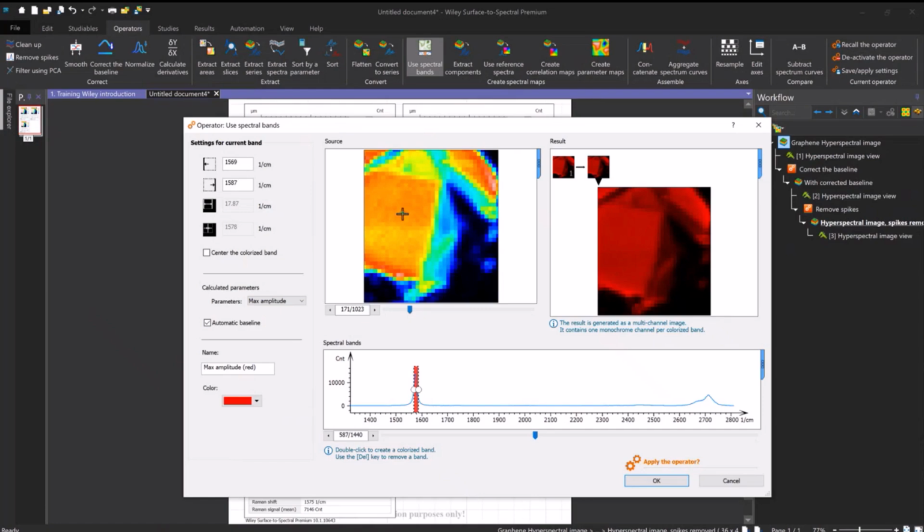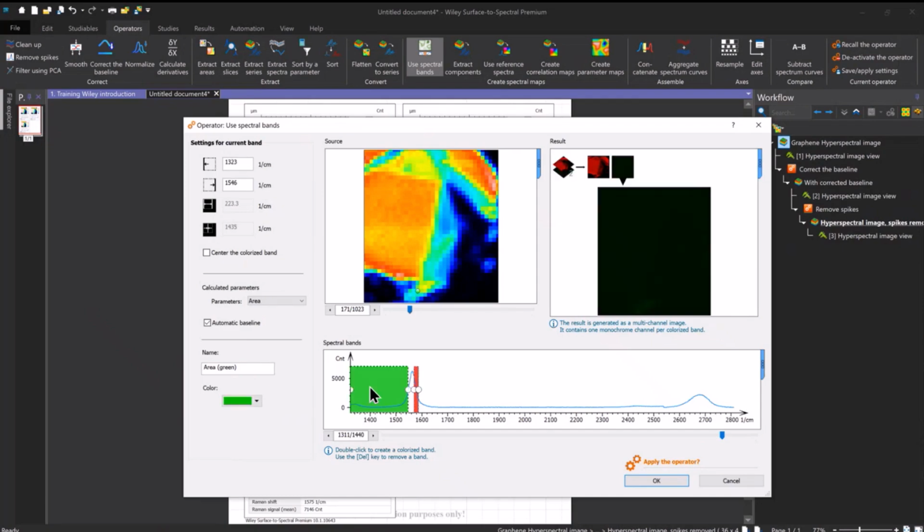But you know, some other spectra within this data set might have different peaks associated with it. So we can drag this dot around, and I can see down here towards the bottom, this peak is shifted a little bit to the left. If I want a second peak correlation, I can double click to open a new window, and I can drag this and resize it.